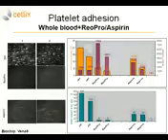If one uses the ReoPro inhibitor, which is a GP2B3A inhibitor, the picture is completely changed. You can see that there are quite a lot of small aggregates and single platelets, but they cover a very small area. So first of all, the area of coverage is reduced, which is shown by this orange graph, but we have increased number of objects.